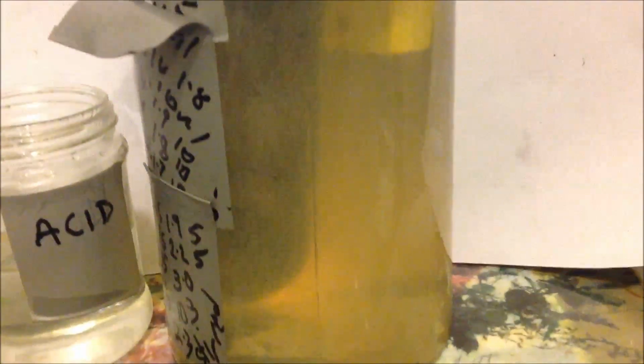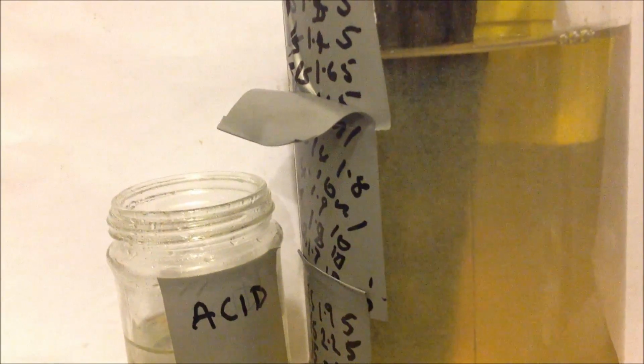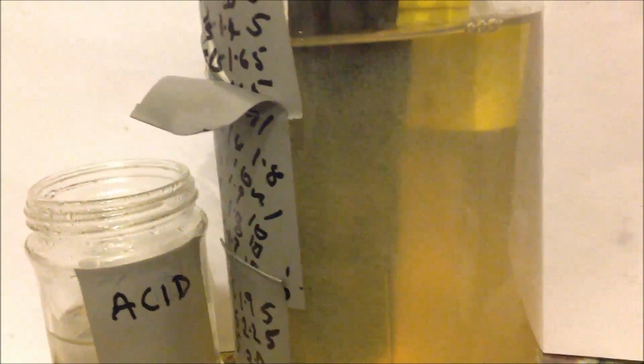It only took 11 ml of hydrochloric acid to get it down to 8.5. It's moving around a little bit, but 8.5 to 8.7. And there is a very fine precipitate. It is growing as I watch it. I think you can imagine, you can see that forming.